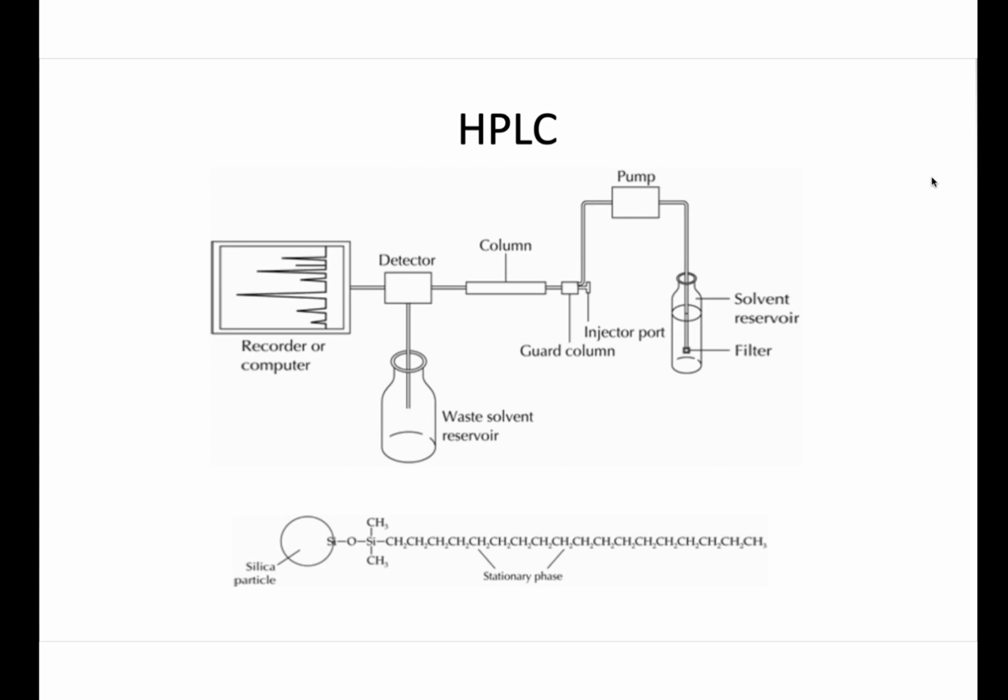When the HPLC gives you the idea of the components, then you can use 2-dimensional TLC, thin layer chromatography, or use different solvents at different times. Firstly with the non-polar, then with the slightly polar, then increase the polarity until you separate all the components.